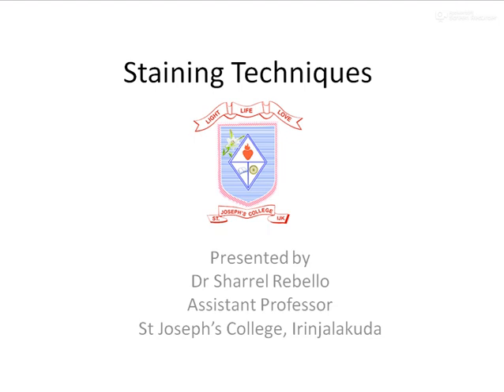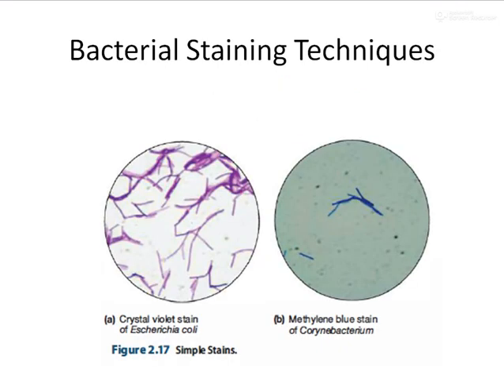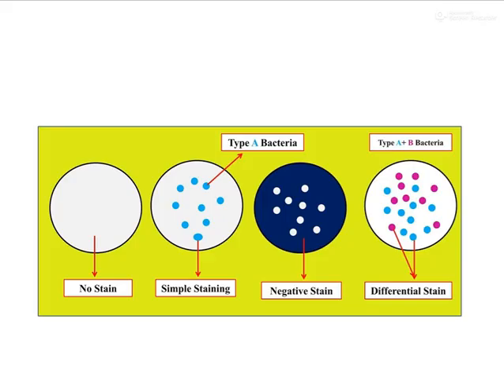In this session, we would be talking about the common staining techniques as well as an overall view of the different staining techniques. You can stain different types of organisms using different stains. When we view under the microscope, if the organisms are colored, we could easily distinguish them from the background, and the shape of the microorganisms could be identified with the help of staining them.